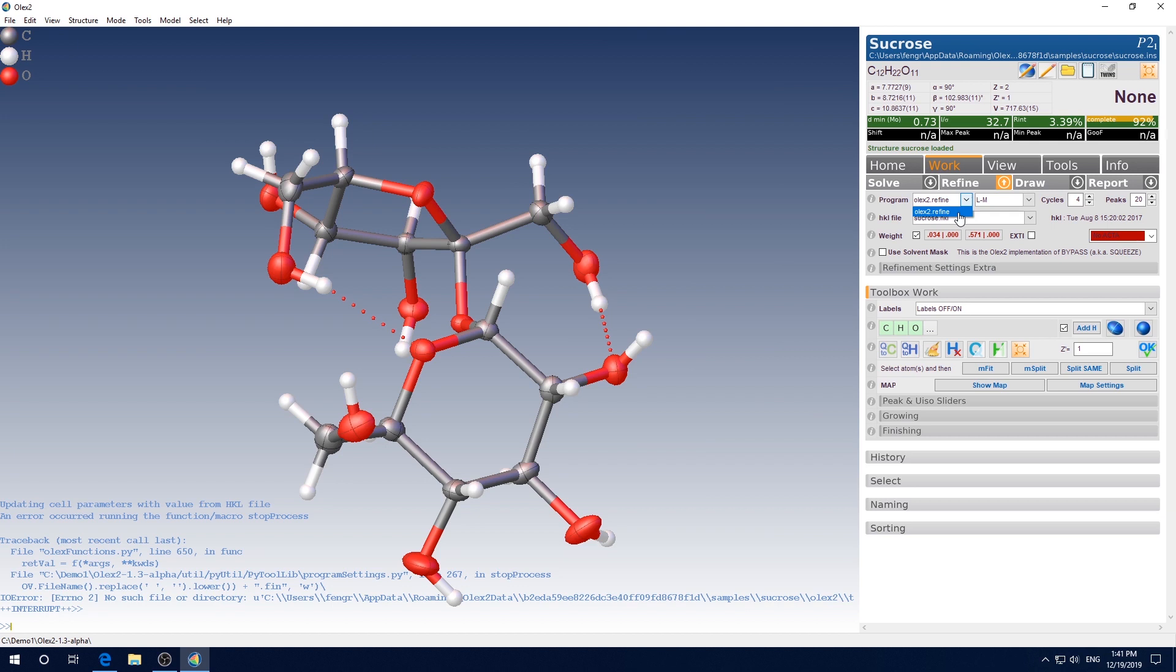That is because Olex2.Solve and Olex2.Refine are developed by the Olex2 team, so they come with the installation. However, although sometimes Olex2.Solve and Olex2.Refine can do a decent job, the mainstream refinement program is still ShellXL at this point, which is developed by another author. So I strongly suggest you to install the ShellXL external program, which I'm going to show you next.